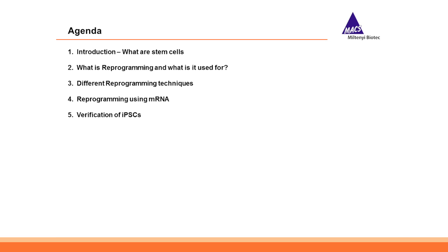First, I would like to start with an explanation of what stem cells actually are. Then I want to introduce the technique of reprogramming and tell you what it is used for. I will introduce different reprogramming techniques and will go further into detail for one technique, namely the mRNA reprogramming. And the last point for today will be the verification of iPSCs. So let's start with the first topic.